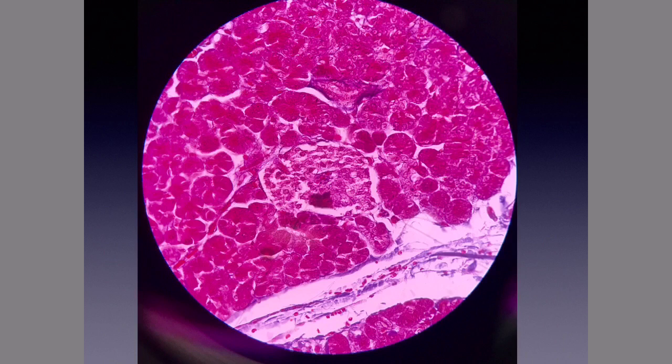You're not required to identify individual cells within the islet, i.e. alpha, beta, or delta cells, just the islet structure itself.